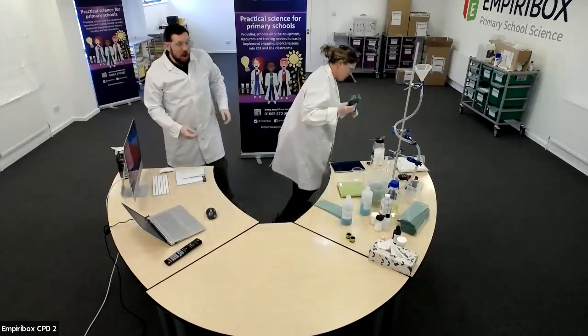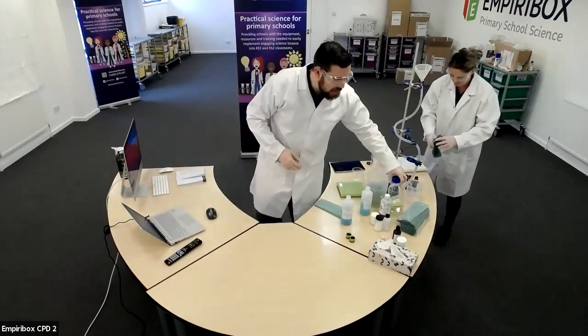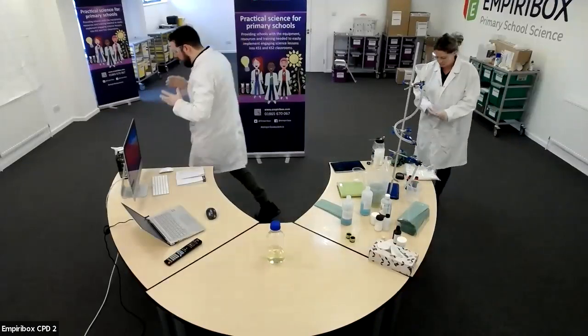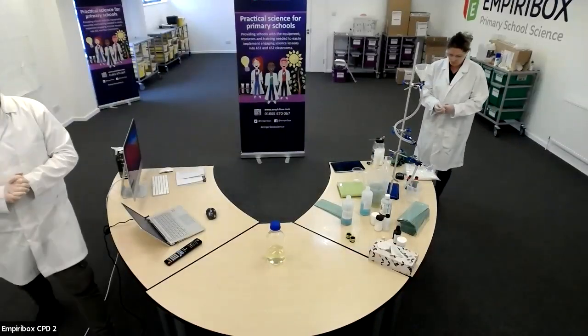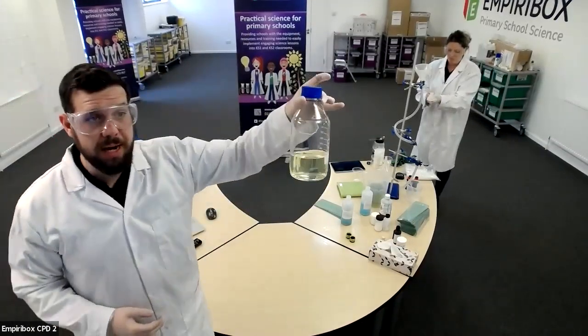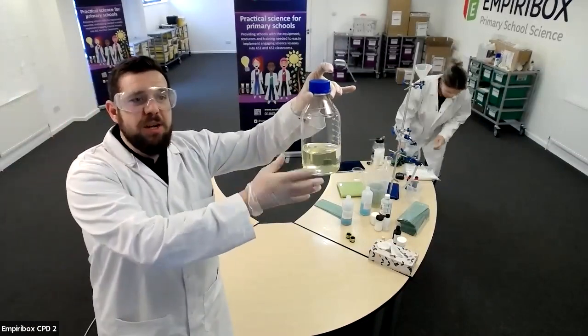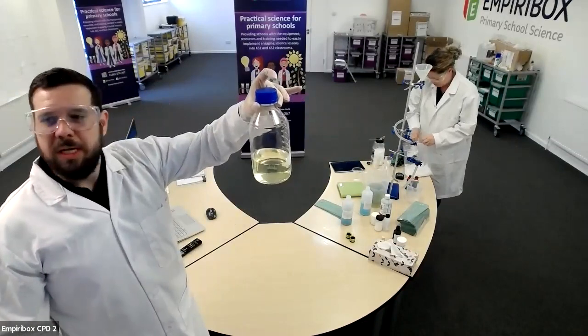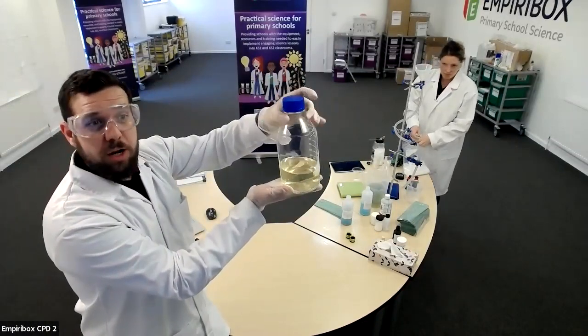All right, now, boys and girls, another thing that tells us about a chemical reaction is when something occurs. But this one we're going to focus on is all about color change. Now, if you look at this bottle of mine, the substance I've got in here is quite clear, but I don't like that at all. So watch what happens if I just shake it. Look very closely.